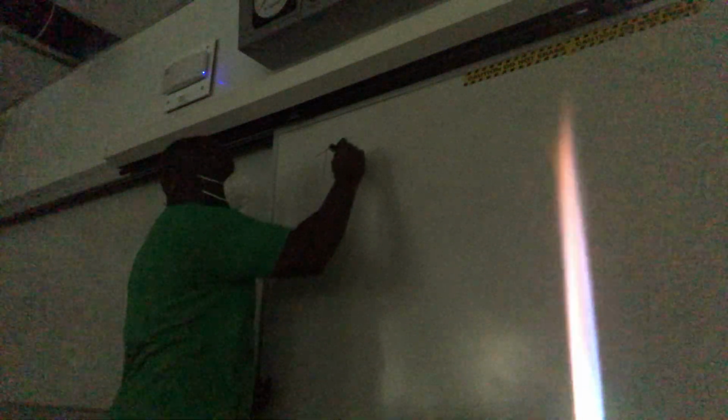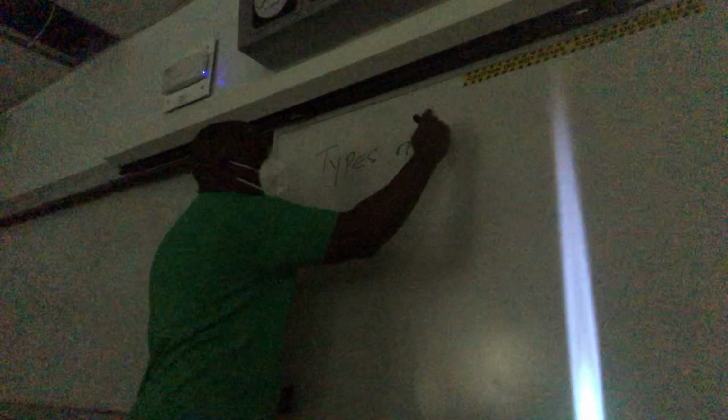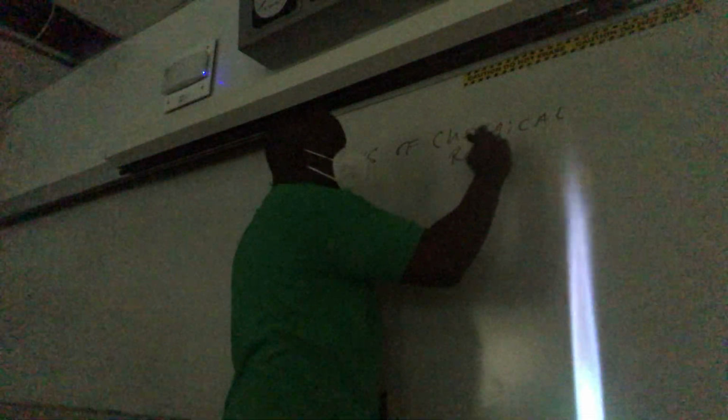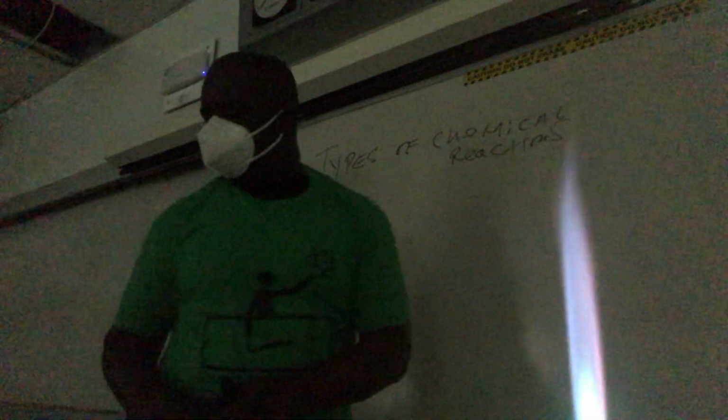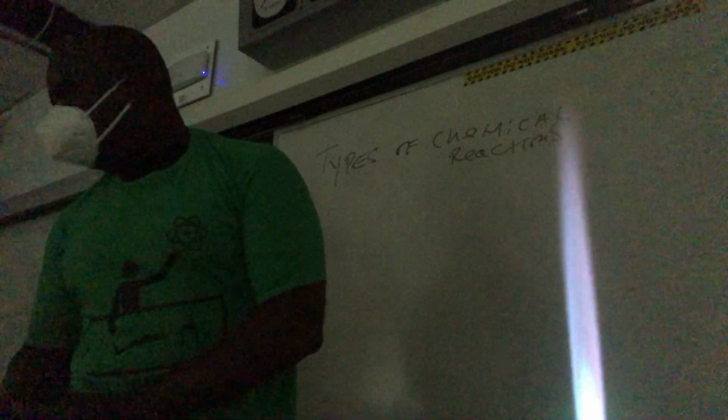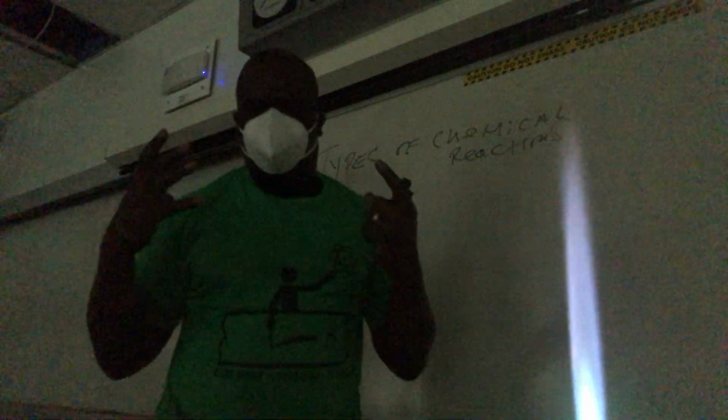So, when you're looking at types of chemical reactions. Okay. All right, so no problem. So, here we go. You have a flame right here, okay? And as always, I should be wearing goggles. You should be wearing goggles in lab, but I'm taking an exception today.